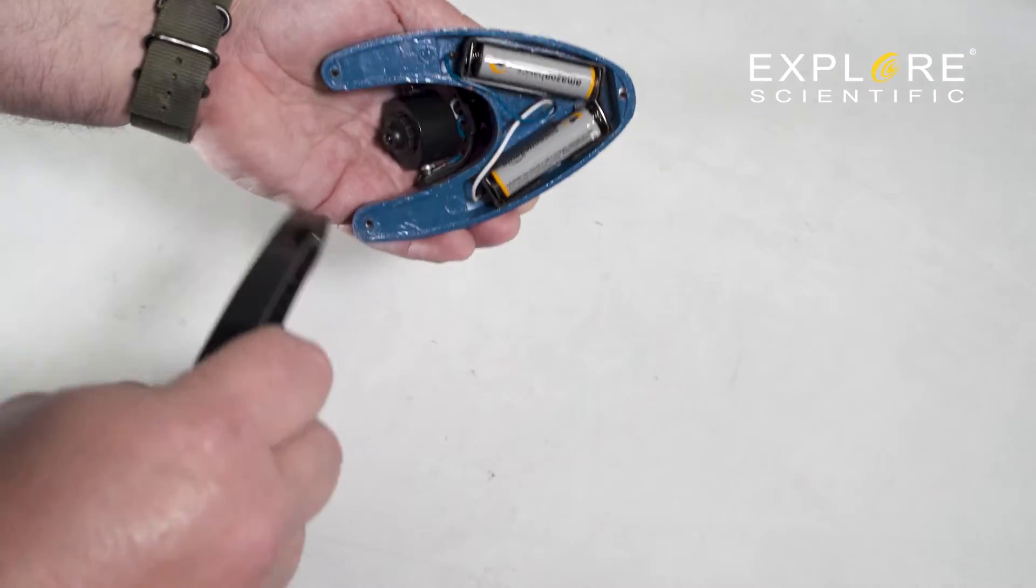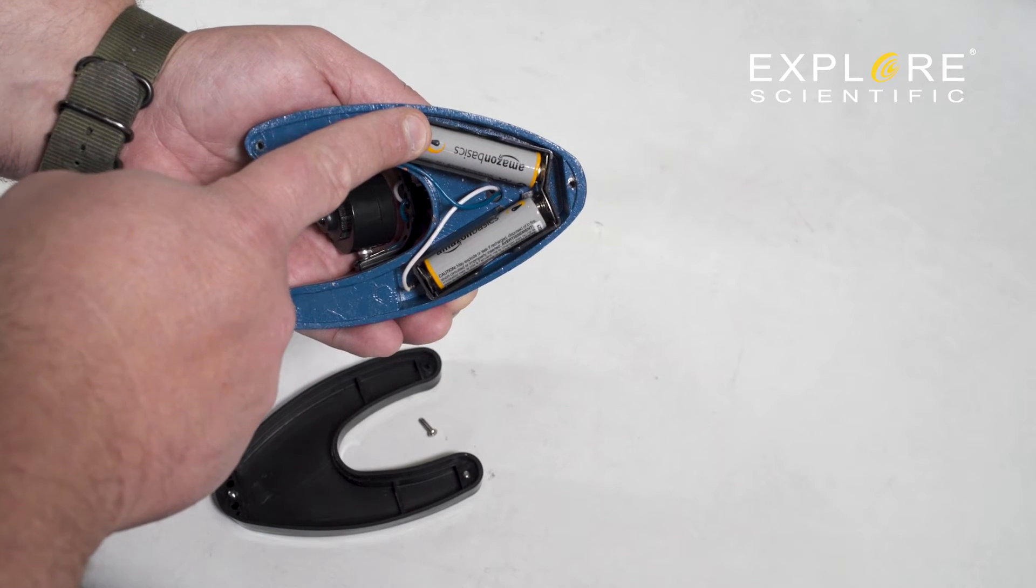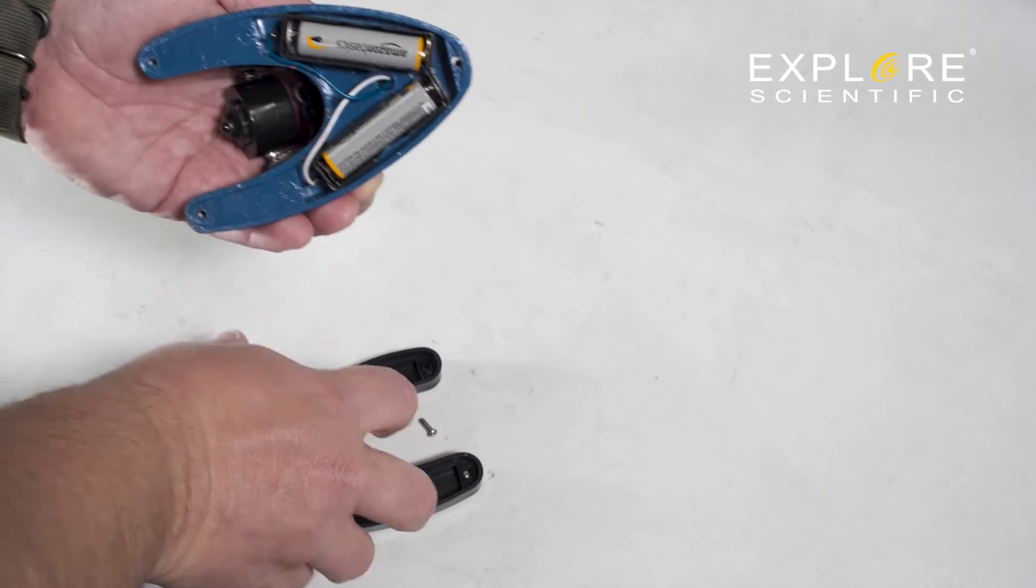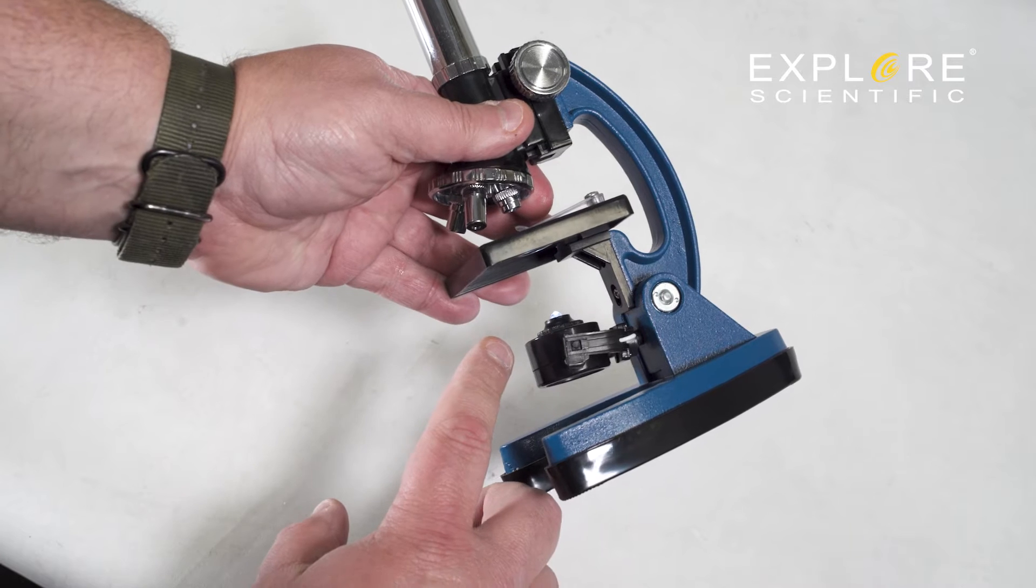This will expose the batteries and allow for easy replacement or installation. Once you have installed the batteries, replace the rubber base and screws. Do not over tighten the screws. You should be able to turn the mirror upside down and see that the light has turned on.